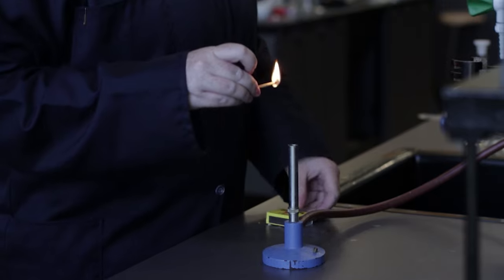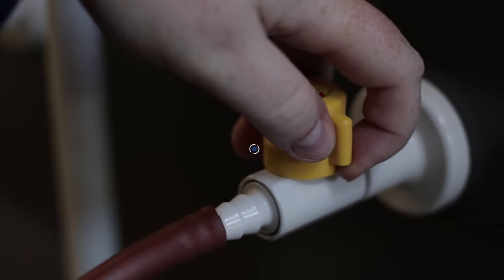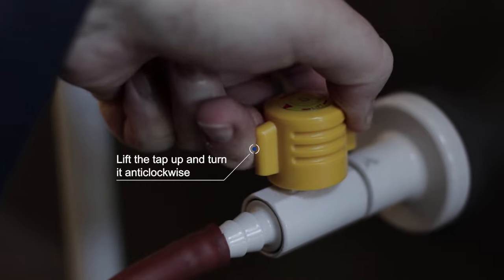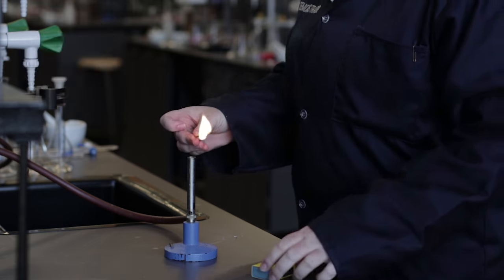Light your match and hold it over the barrel as you slowly open the gas tap by lifting up the tap and turning the tap anti-clockwise. Do not cross your arms when doing this process.